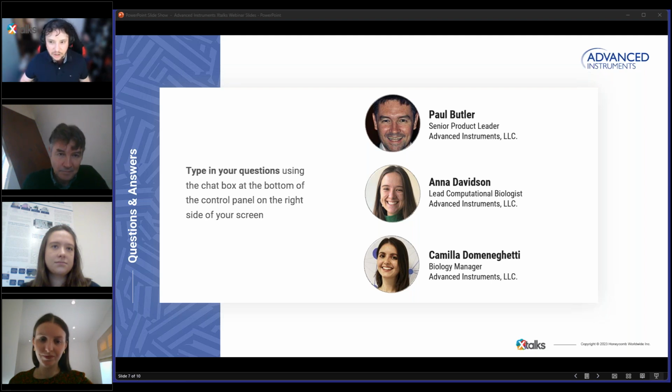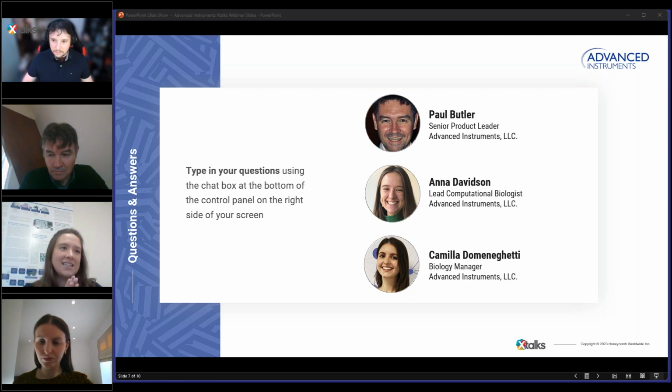I've got another question here, wondering, does the neural network continue to learn after the install? I will take that one. Another great question. So this network doesn't continue to learn. Once we've trained it up, so we think it's learned everything it can from the data set that we give it, we stop that training. So we have a fully validated network that doesn't continue to go off and do unexplored things during your customer data set.